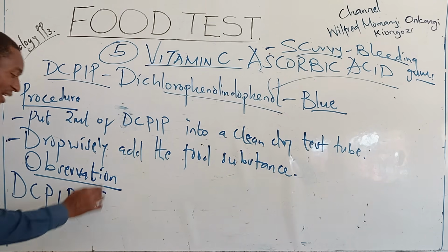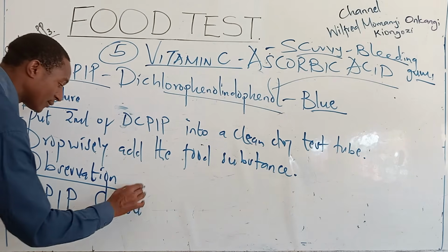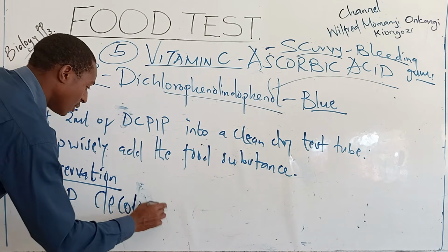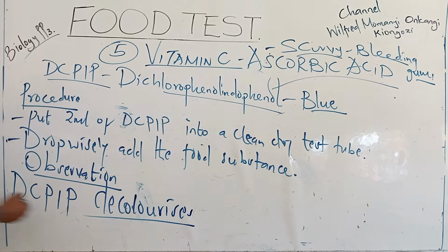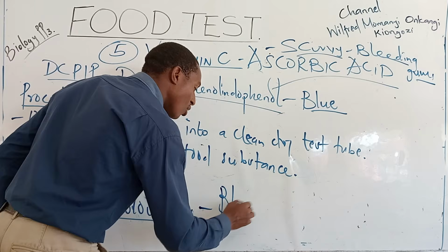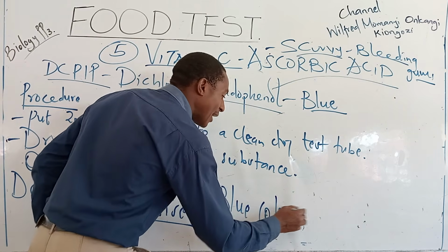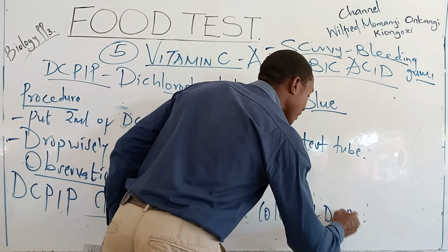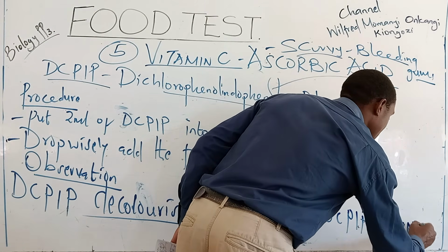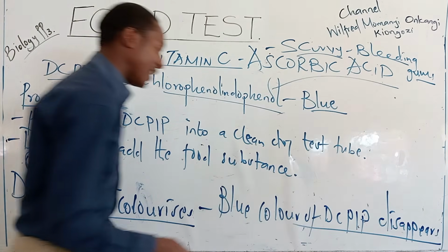DCPIP decolorizes. In short, the blue color of DCPIP disappears. What does it mean?